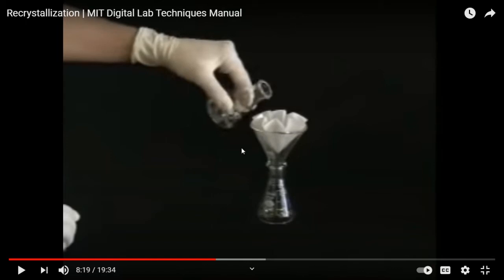So what we do is we put this whole setup on our test. You cannot show this drawing as an answer for hot filtration. You must have, are you making notes with the colored pens in your notebook? When I check your notebook, I'll see how many of you were actually doing what I asked and emphasized. This hot filtration is wrong. I mean, not as effective.